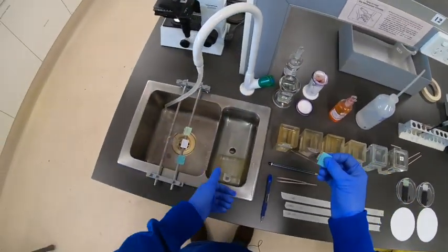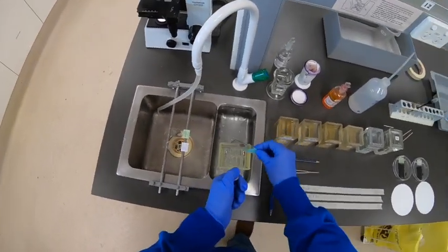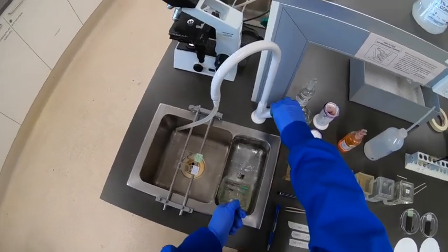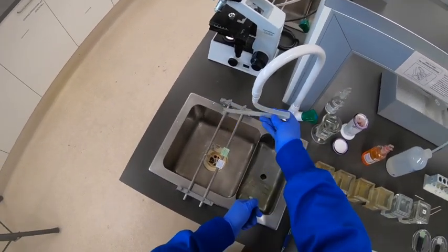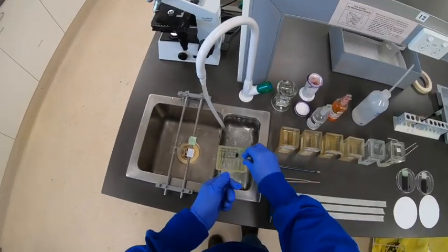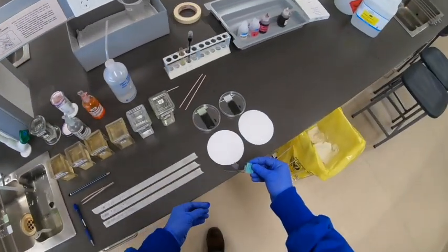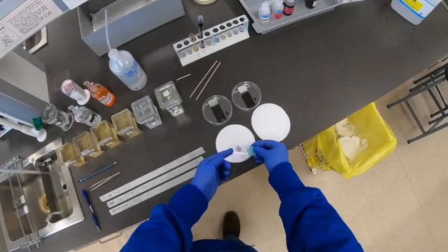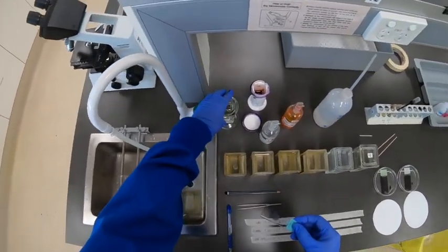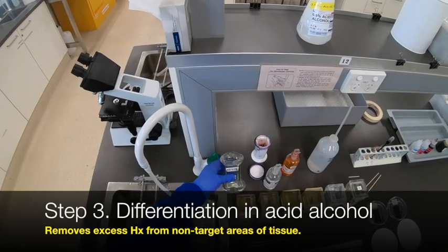We could leave those slides in the tap water for a few minutes and they would begin to ripen, but in fact they're actually overstained intentionally. So in order to really bring out the right balance of hematoxylin, we will have to engage in a differentiation step. You can see, if I hold that over a bit of filter paper, there's a little bit of background staining even on the glass itself — that just shows you how much hematoxylin is there. So we use acid alcohol; that's the differentiation step.